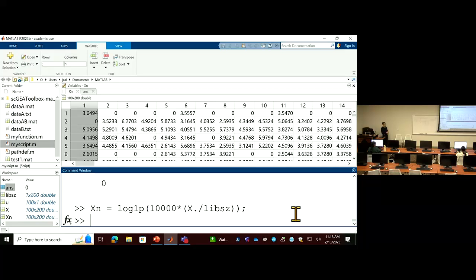It's not too much and not overdone. There are many other ways to do normalization, but many of those methods tend to give you over-processed results. So you want to keep everything simple. Normally this is enough to give you reasonable normalized data for most downstream analyses.